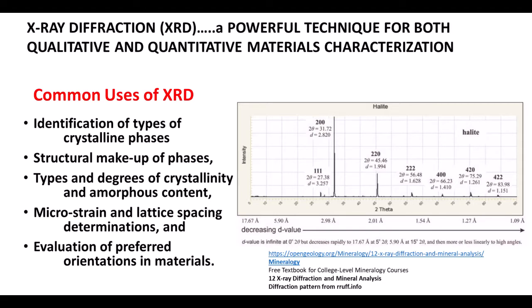This is because the D spacings of the material, even with the same crystal structure, have a strong influence on the D spacings based on the chemistry of the material. As such, we are able to make very good correlations between the measured D spacings of our samples and the known D spacings of materials previously characterized by XRD. In other words, we can make use of an XRD database.